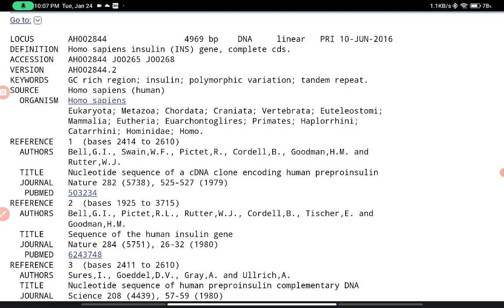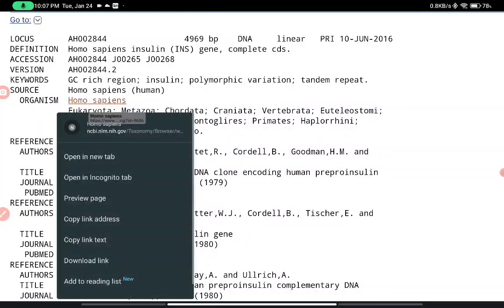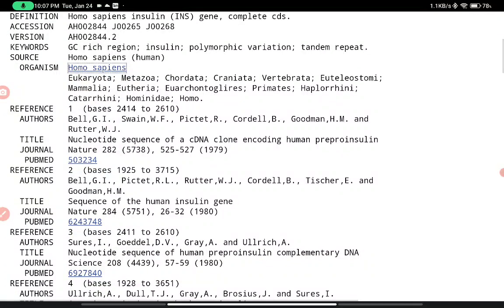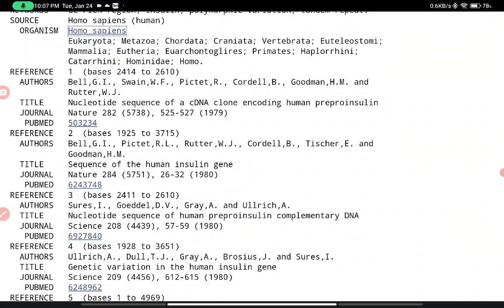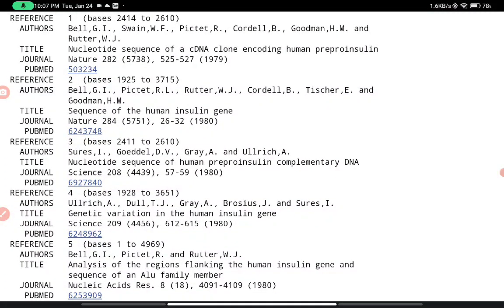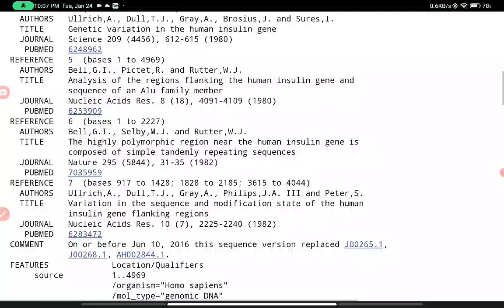The source organism — Homo sapiens — is available, along with the taxonomic classification: Eukaryota, Metazoa, and so on. In the header, reference information is also given, indicating from which base pair to which base pair the contributing scientists or authors have worked, under the title of a paper published in Nature. Other titles and author names are also listed.